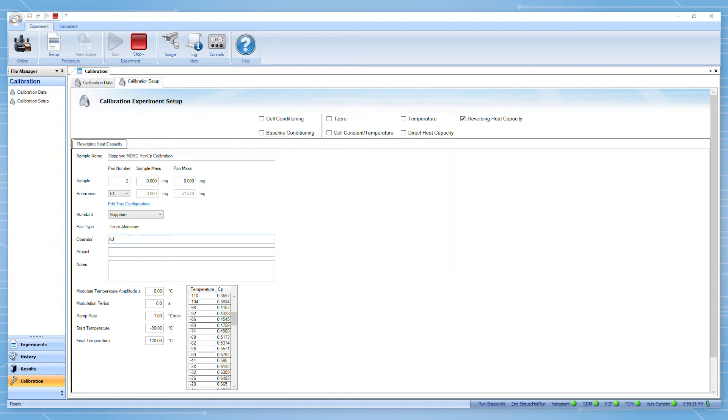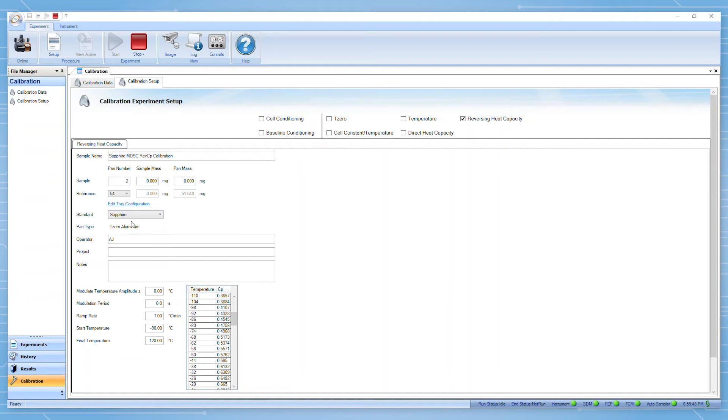You can select which standard you want to use for your calibration. For this demonstration, we will be using sapphire. A small clear sapphire disc is provided in the kit which came with your instrument.